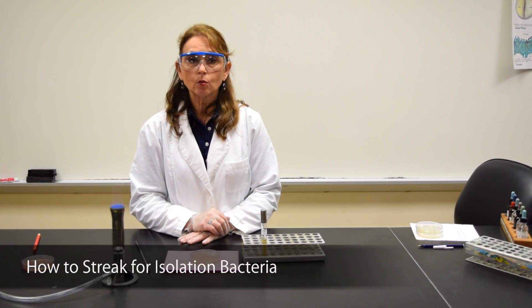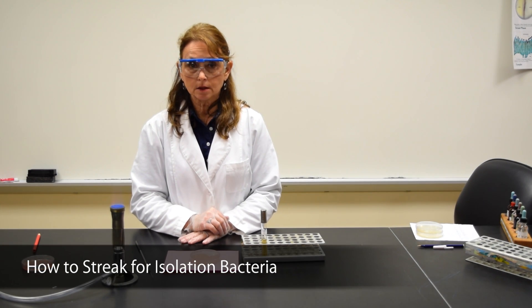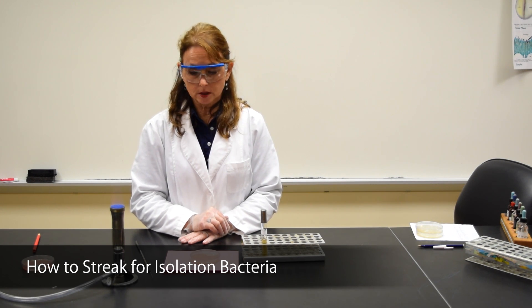This demonstration is to show you how we streak for isolation of bacteria. The procedure that I'm going to be showing you is called the T-streak.